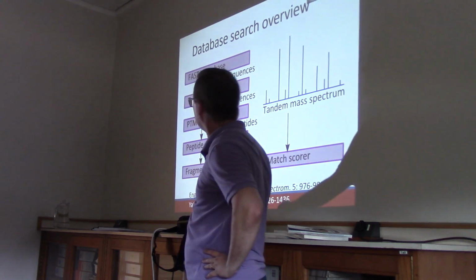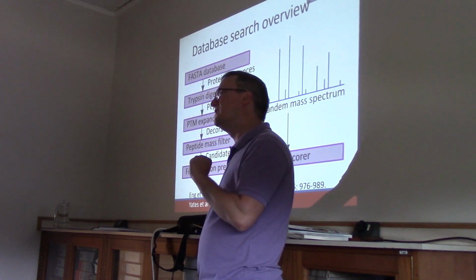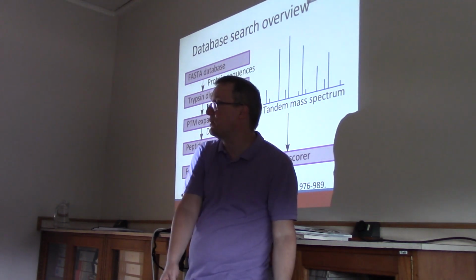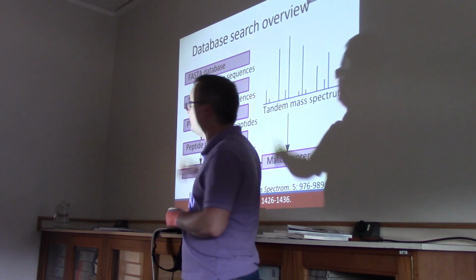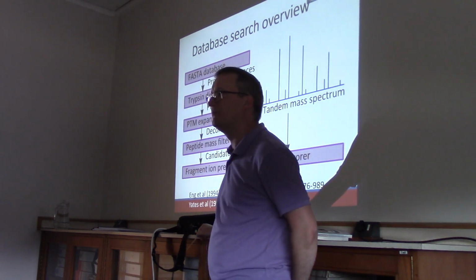That provided a bunch of protein sequences. But remember, what we're identifying directly are peptides. So in silico, we need to do some of the same steps you just did on the bench. You digested up your proteins on the bench, therefore in silico, we need to have a function that acts as a trypsin digester to produce lists of peptide sequences from those.